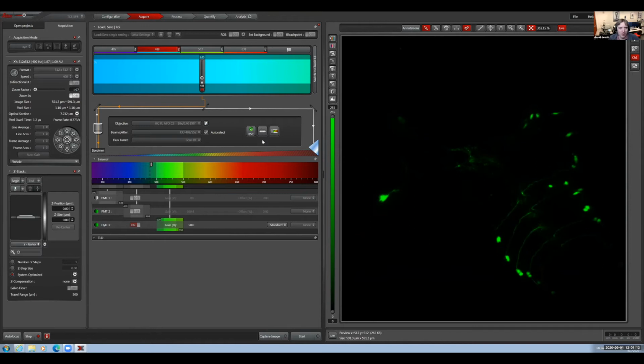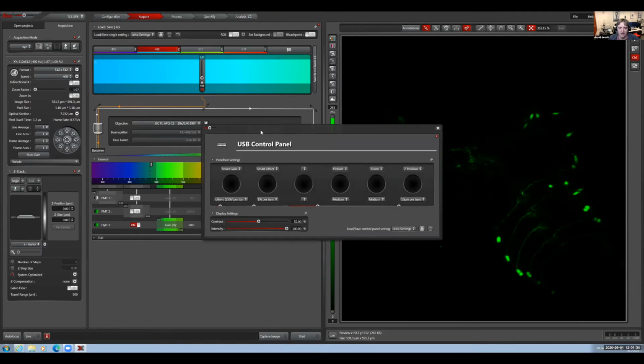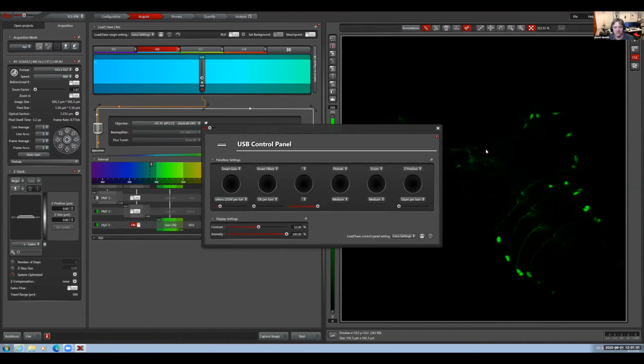Right. And so all of those things controlled with those dials are in the software somewhere. Let's see, I just want to stop it real quick and show you where most of those are. Okay. So that dial or that control panel, you can actually bring up the settings for it right here with this button. Okay. And you can change what each of those knobs does, and then below it, you can change how fast each of those adjusts it.